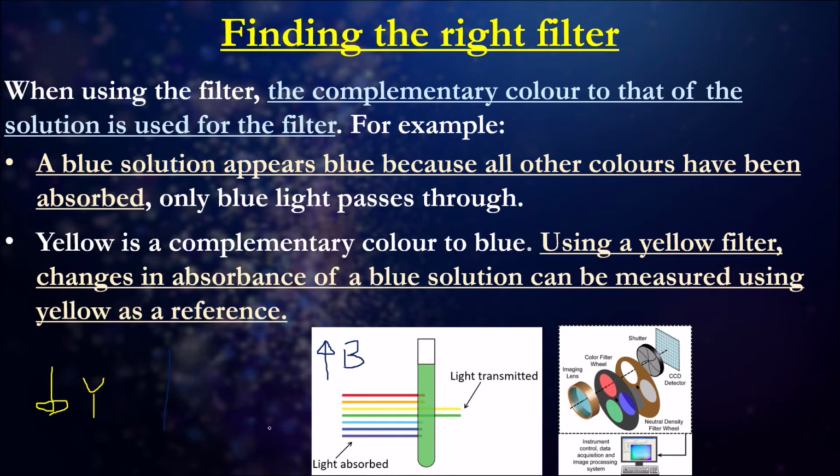Just think about it this way. The reason why colors turn more green, or a lighter blue color, is because there is more yellow light to move it towards the lighter component of the spectra. If we remove the yellow, then what we have more is the blue spectra, and so that's what we end up seeing. So based on how deeply colored or the intensity of that color, we can also work out the type of color that was absorbed.